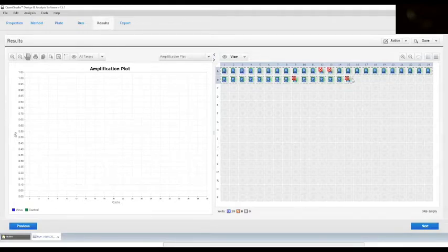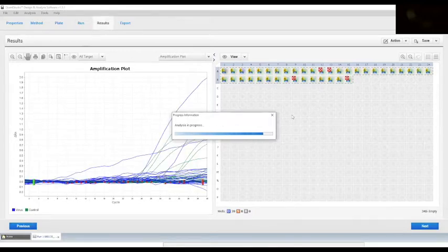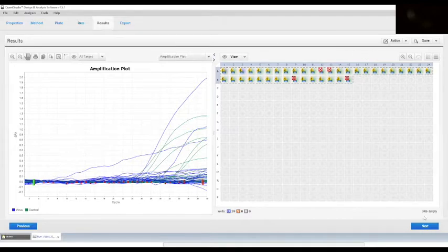Once you have completed the reanalysis, you will see the curves with nice amplifications of the samples in blue for the virus and green for the internal control.